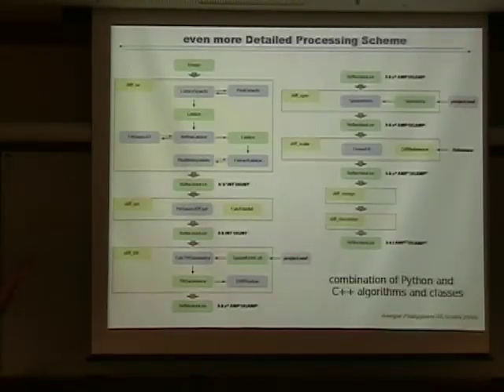Okay, but here you start the project without having to use that. I mean, at the very end, when you have your 500 diffraction images. And the question is, when you start with some diffraction, usually at 0 degrees, and then you have to start to go into 3D by having one diffraction image, so you are completely underdetermined for all of the lattice lines. So that's the problem to actually start the lattice line. We do not even use the lattice line at this point. There's no need to use the lattice line until the very end when you do the final merge.